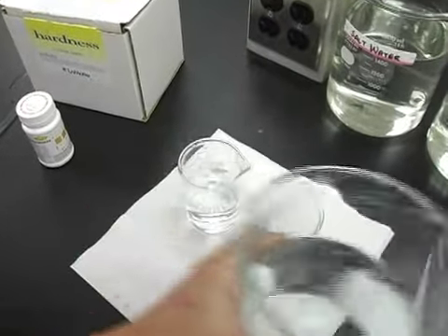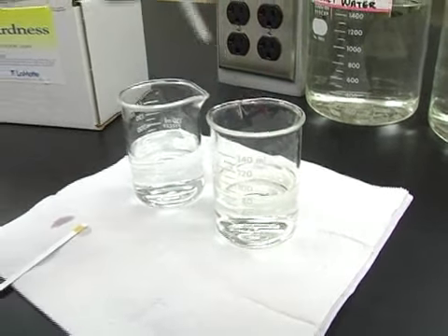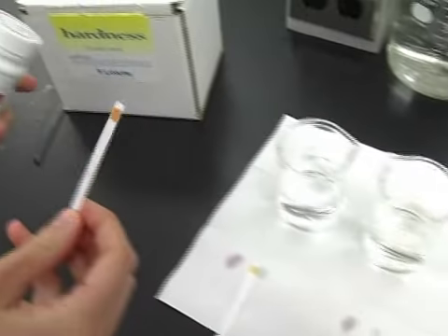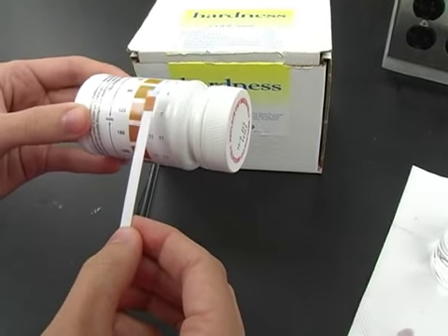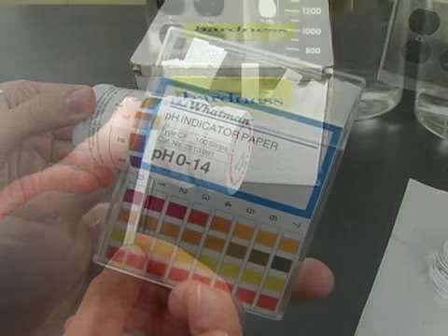The second method is again test strips. Dip a test strip into the sample for 3 seconds. Remove and gently blot the excess water on a paper towel. Then, match the color of the test area with the provided chart and record your ppm.